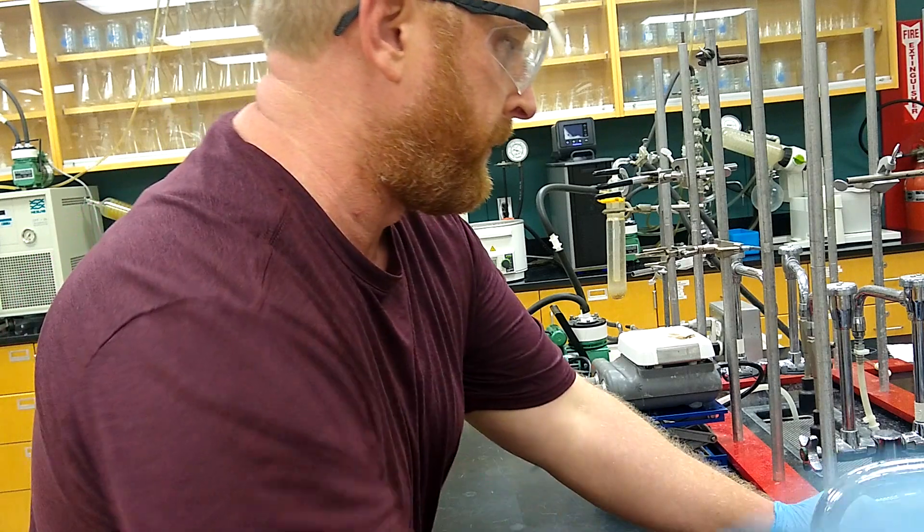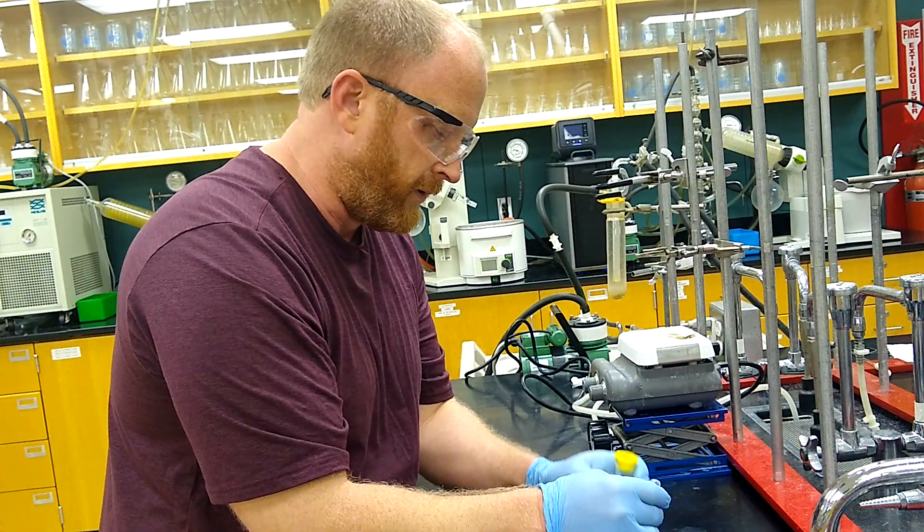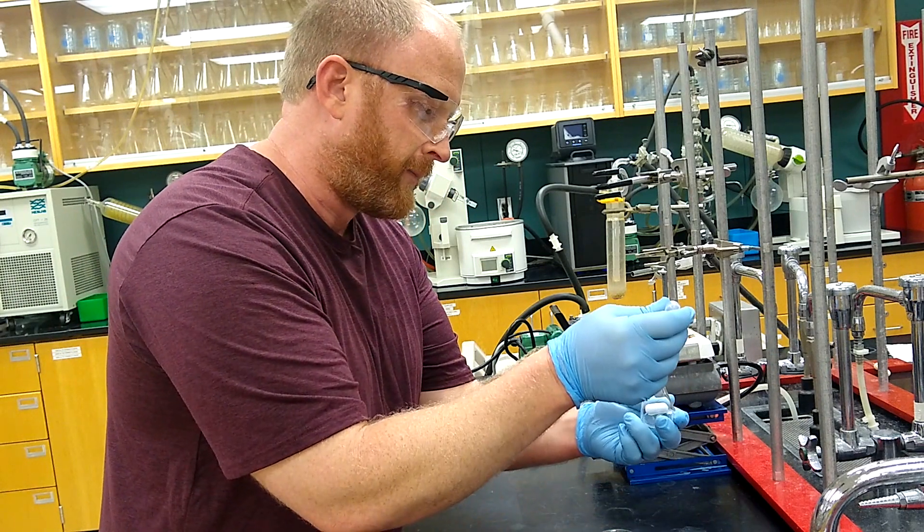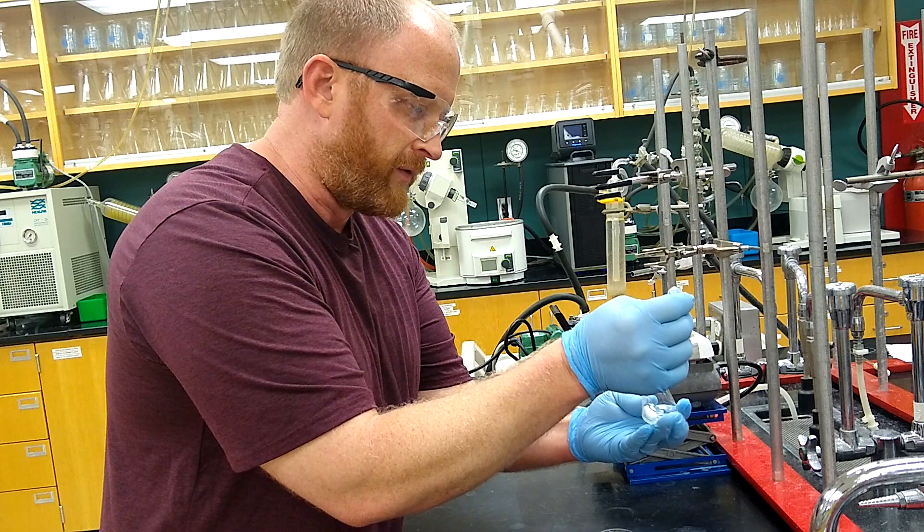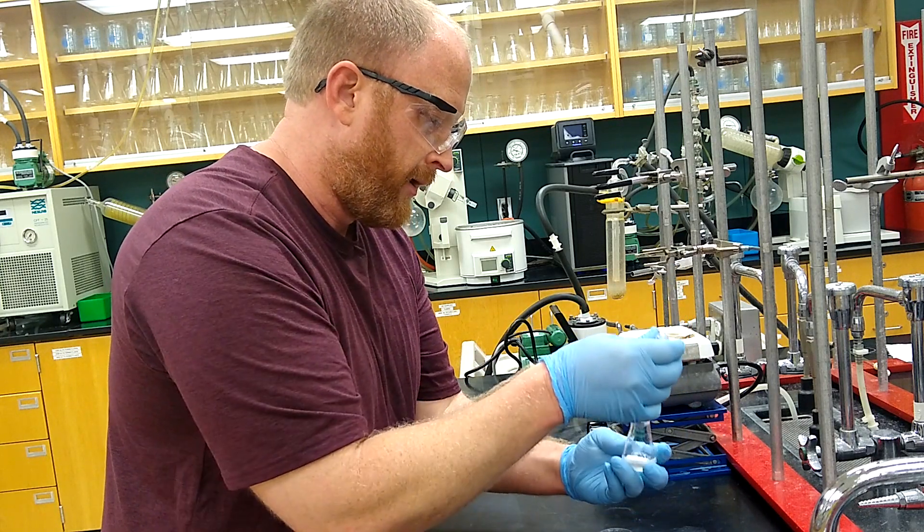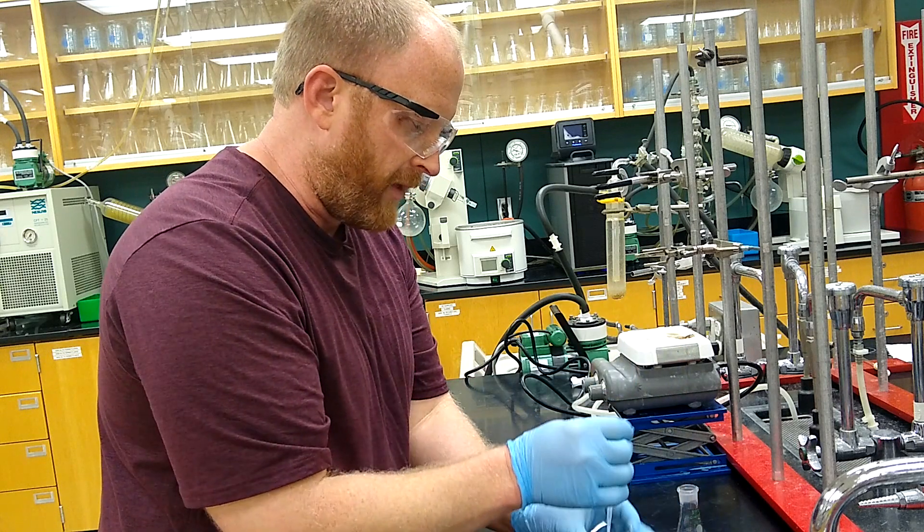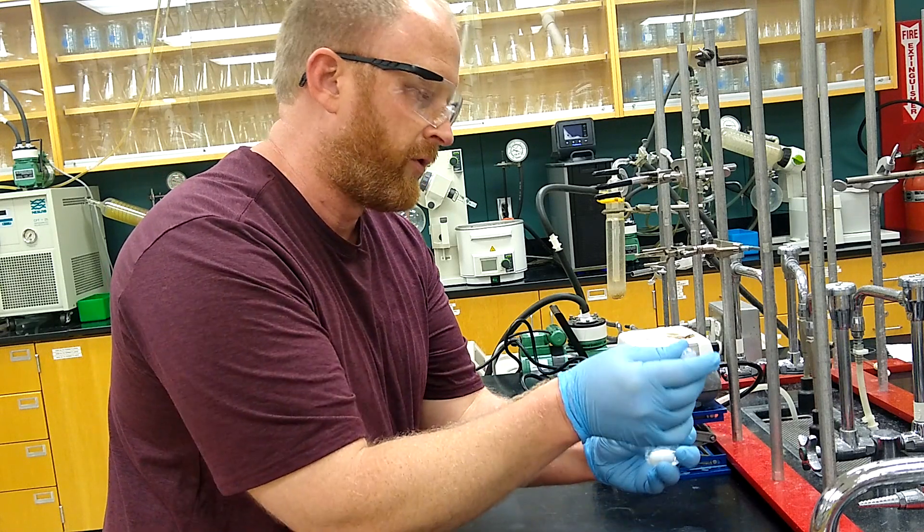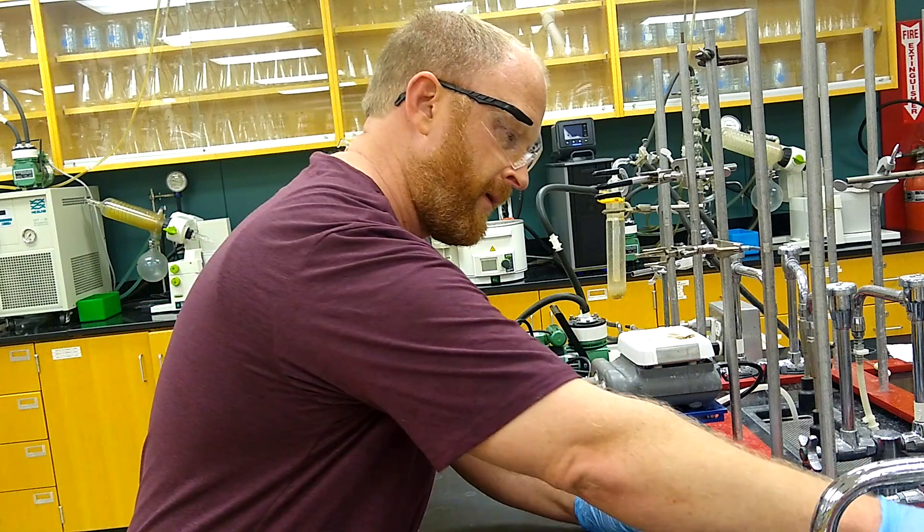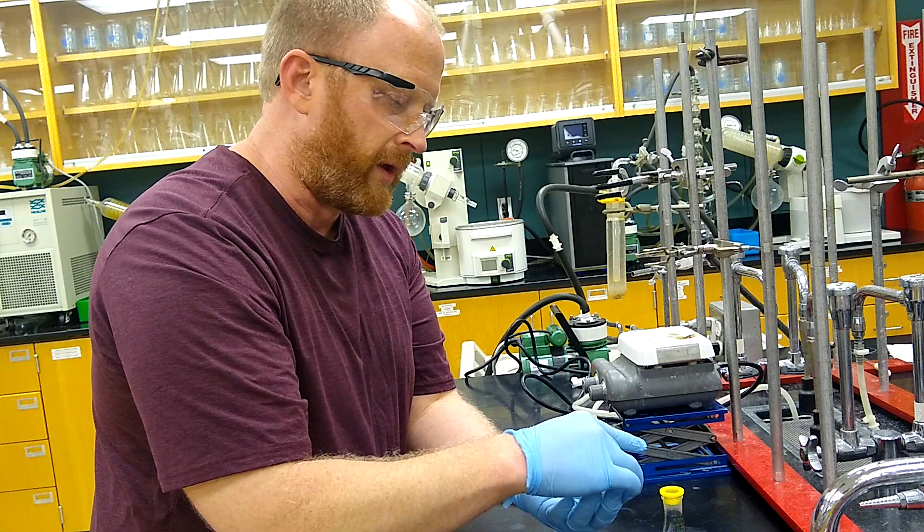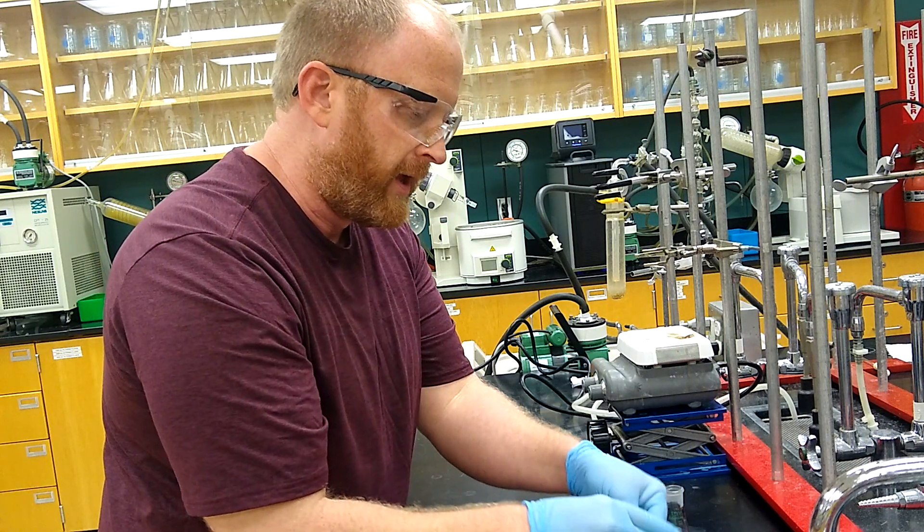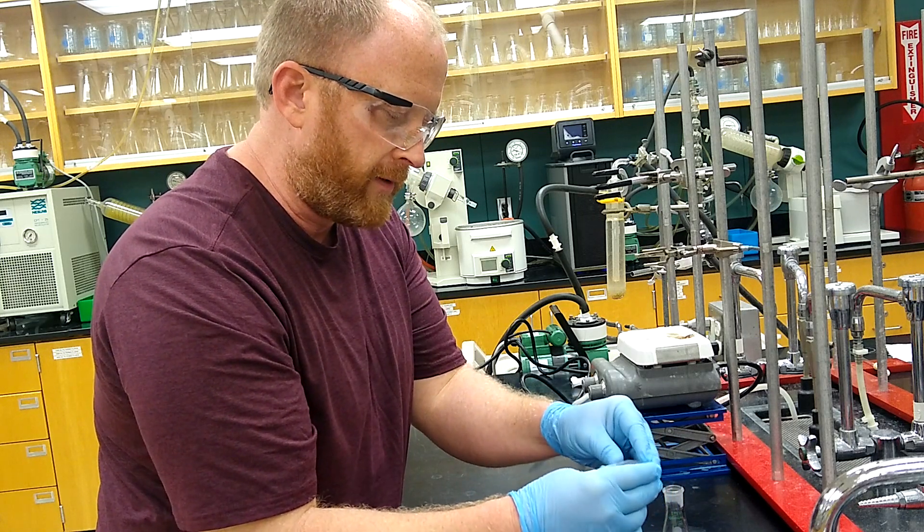Now I'm adding a few mL of aqueous sodium hydroxide—we'll email you the exact amounts of everything we used later. We're adding the base here so our cresol is deprotonated, and then we're adding some tetrabutyl ammonium bromide to act as a phase transfer catalyst.